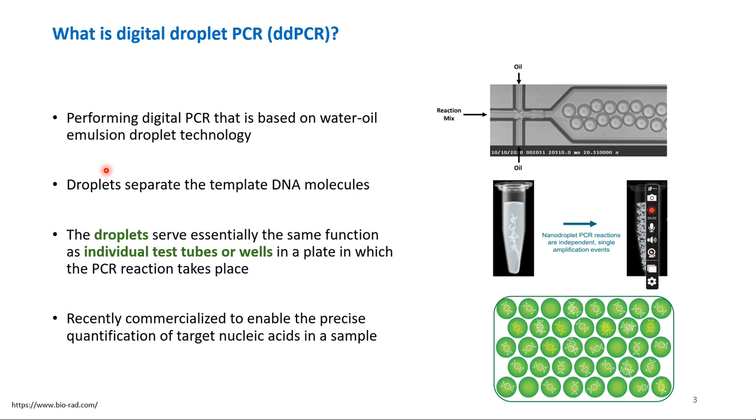And I'll show you very quickly how you can set up a ddPCR, since we have a lot of myths and a lot of complications about ddPCR. Many people I heard are afraid of ddPCR, and it is not very common, to be honest, in an academic setup. So I will just show you very quickly how you can do a ddPCR using your general qPCR or general PCR knowledge.